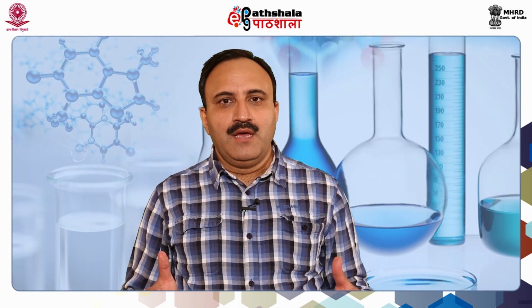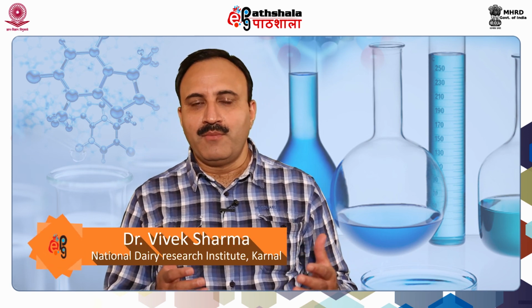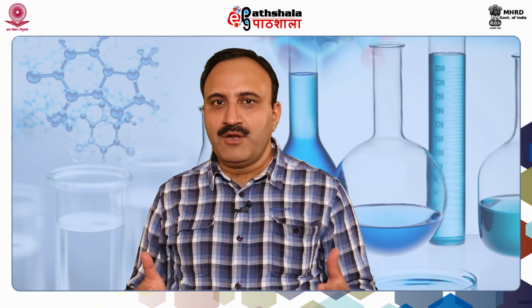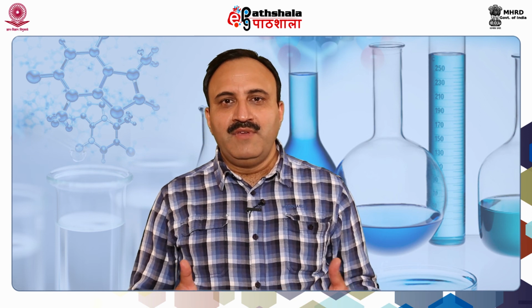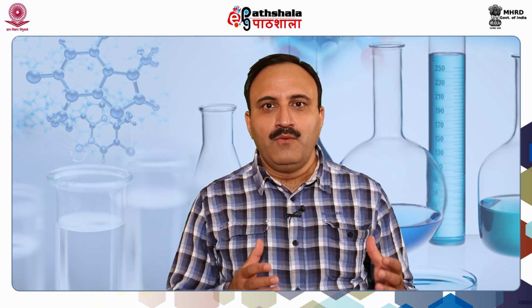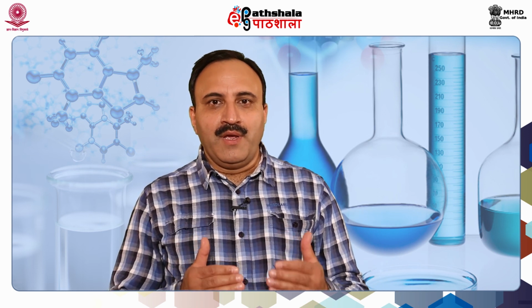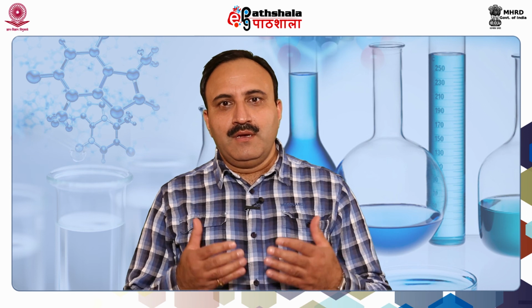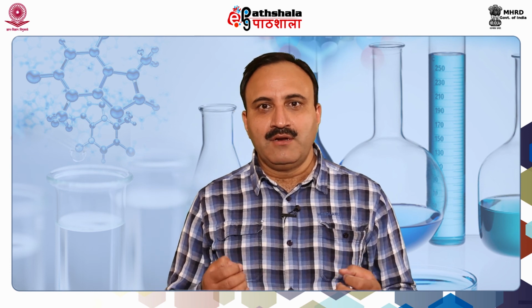Dear students, in this lecture we have learnt about the basic principles involved in gas liquid chromatography. We have also learnt about the different components involved, whether detectors or injectors, and the limitations of the detectors. We have also learnt about the different types of columns and stationary phases used in filling the columns. Now we are prepared to start our work on GLC. I hope you have enjoyed the lecture and understood the concept of gas liquid chromatography.